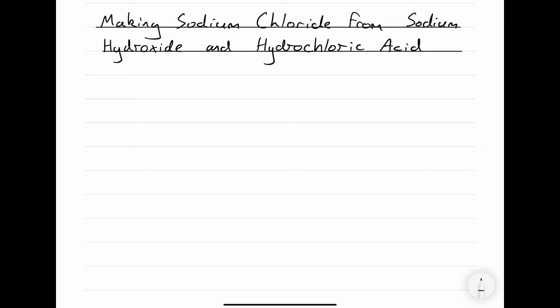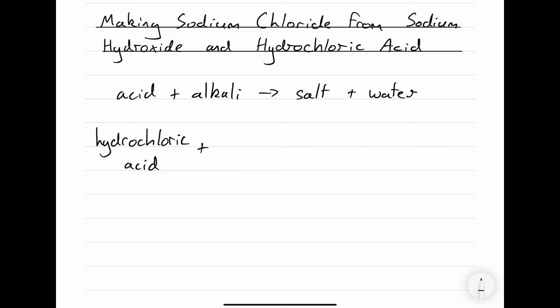In this video we're going to make sodium chloride from sodium hydroxide and hydrochloric acid. A neutralization reaction is a reaction in which an acid and alkali react to form a salt and water. The acid we're using is hydrochloric acid, and we're adding it to sodium hydroxide, which will react to form sodium chloride and water.